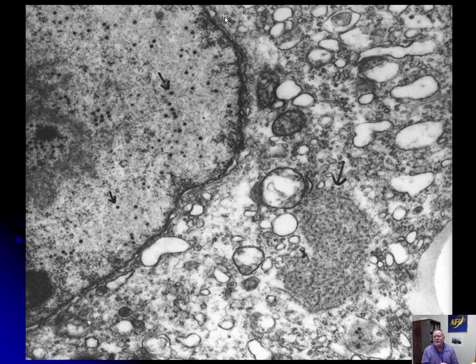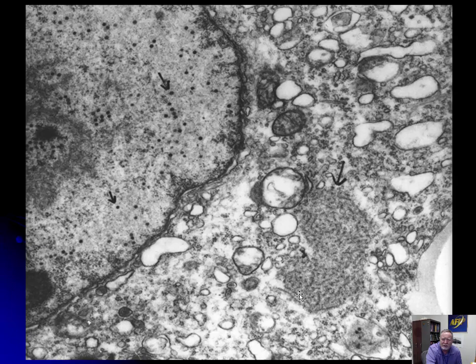Still with distemper. Here's a close-up of that viral protein inclusion — there are no virus particles here, just a bunch of filaments of protein. Will these be used to make the virus? No. When the virus hijacks the cell's machinery, it certainly makes all the proteins necessary, but it makes some other proteins too, and those will not be used.